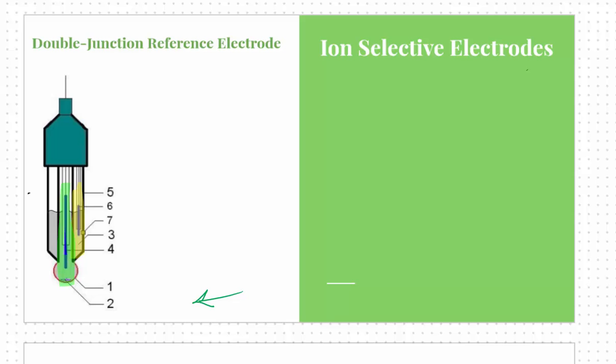So this is why a pH electrode is accurate for locating pH and changes in pH, but not for the concentration of the hydrogen ion. Because we don't know what this junction is, we can't directly measure the concentration of the hydrogen ion. We can measure the changes in pH though. That is definitely an accurate measurement to make. But I just threw some more words out to you.